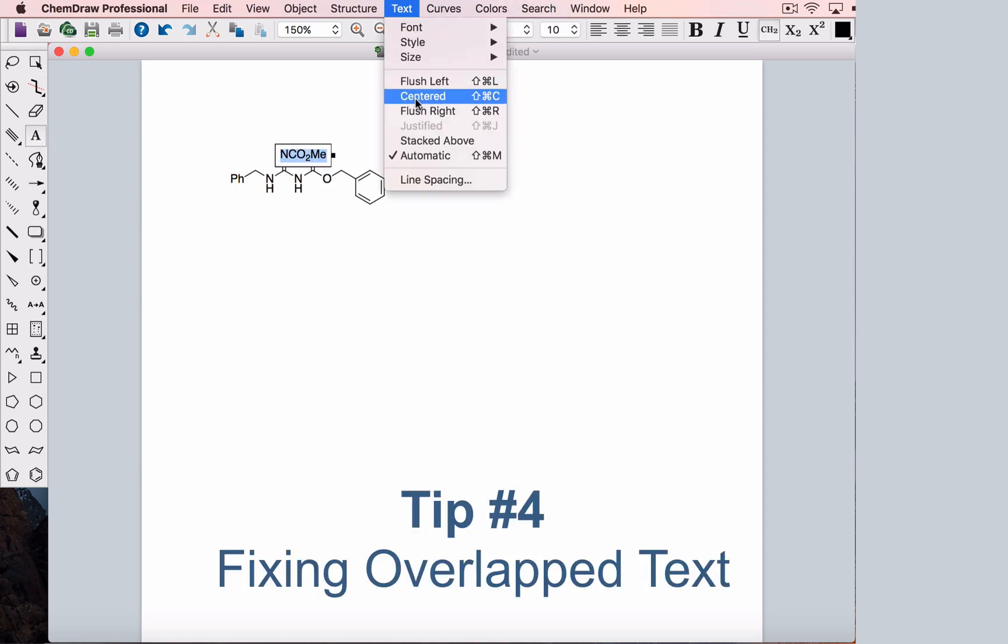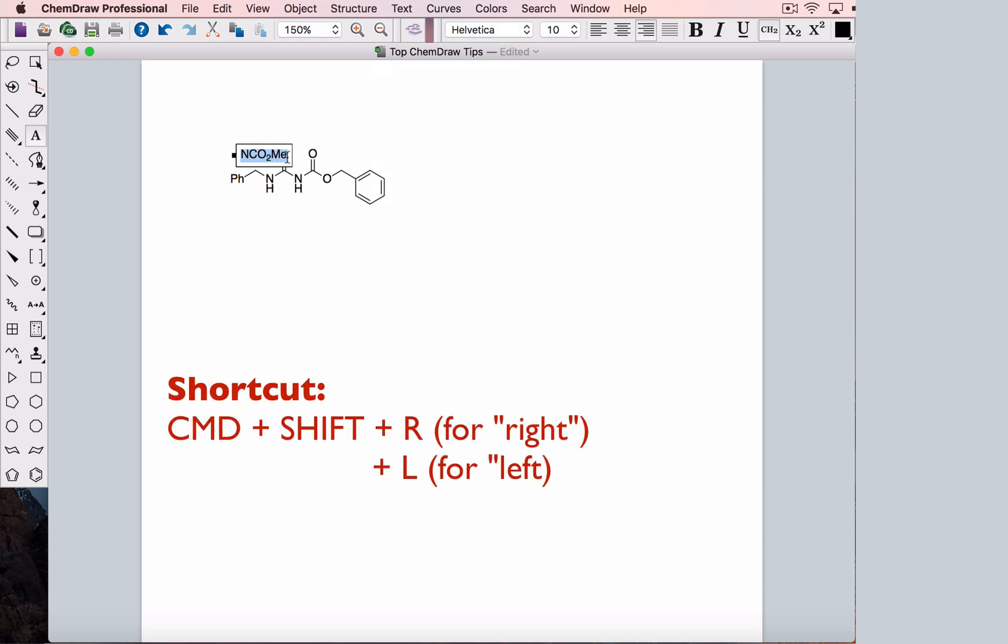Visit the text menu and select flush right to anchor it at the right side. But you'll notice our group looks like it's connected at methyl rather than nitrogen. What we need to do is type the label in reverse, beginning with the ME.